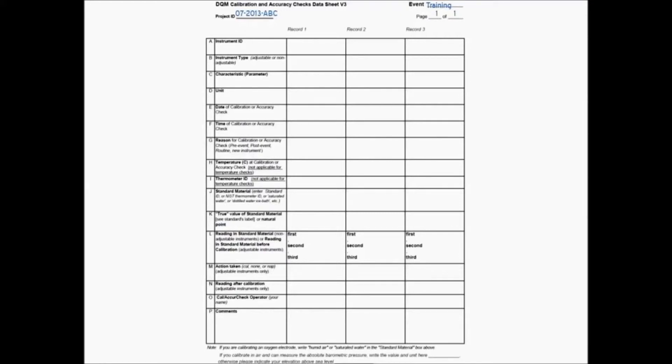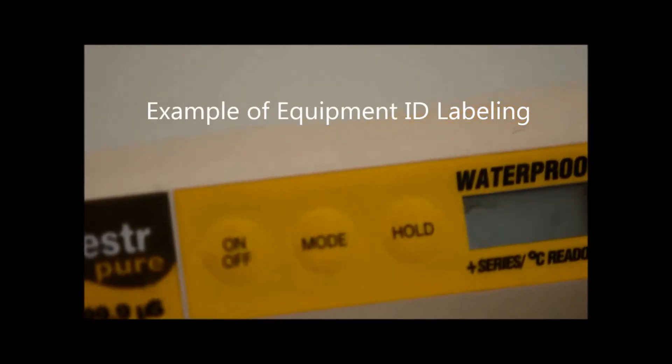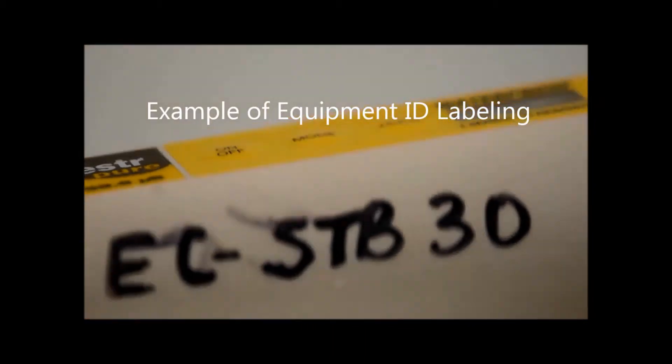Enter the instrument ID. For example, TDS CWT 011. This refers to a TDS meter owned by the Clean Water Team, and it's the 11th one that we've purchased.